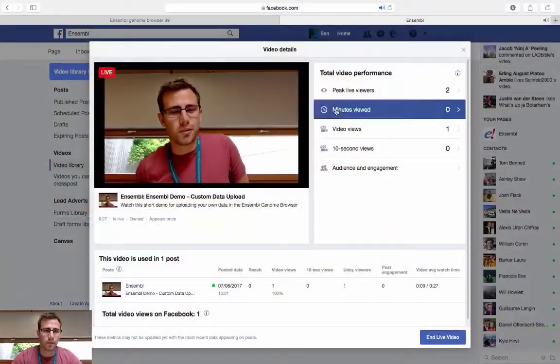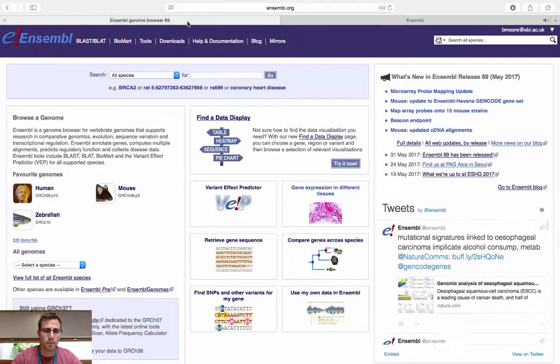My name's Ben, and in the next 5 minutes hopefully I'm going to show you how you can upload your own data to the Ensembl Genome browser. So what we're going to be doing today is looking at the Ensembl Genome browser, and we're hopefully going to show you how you can upload your own data to Ensembl.